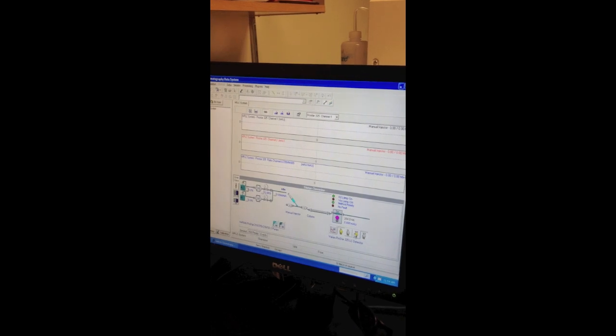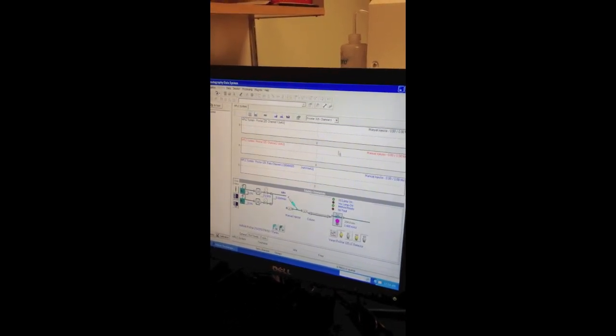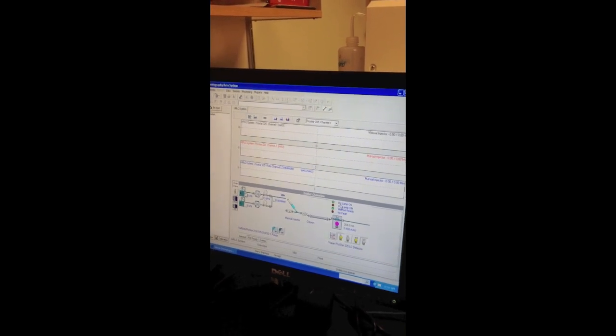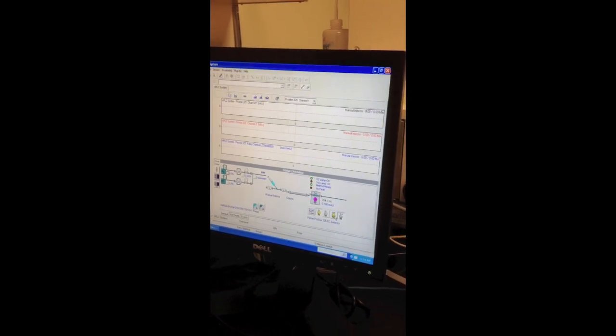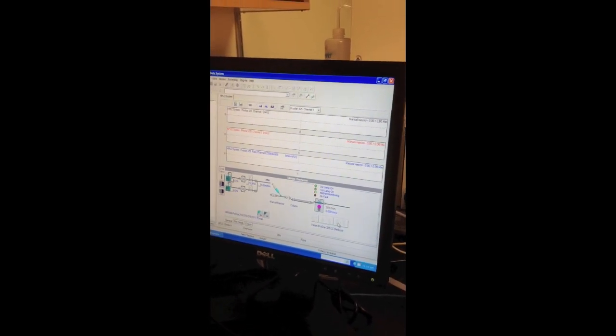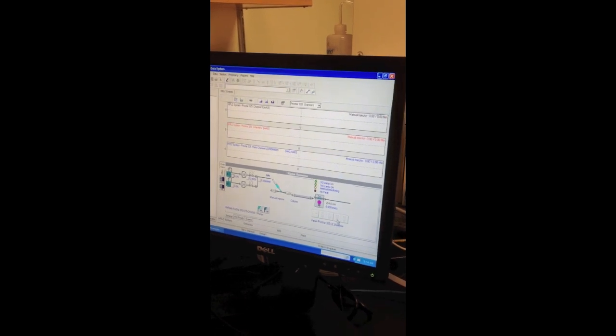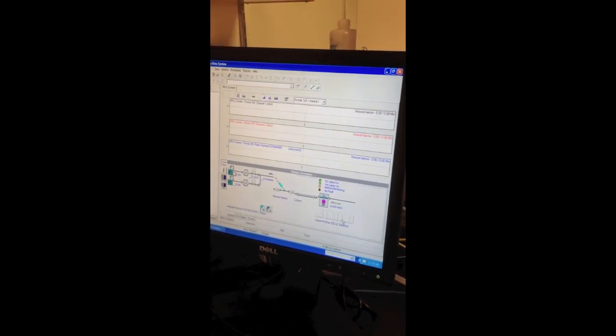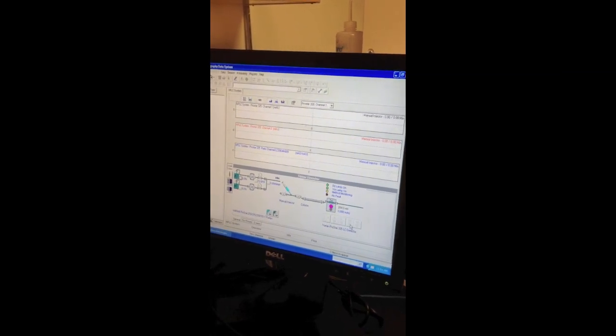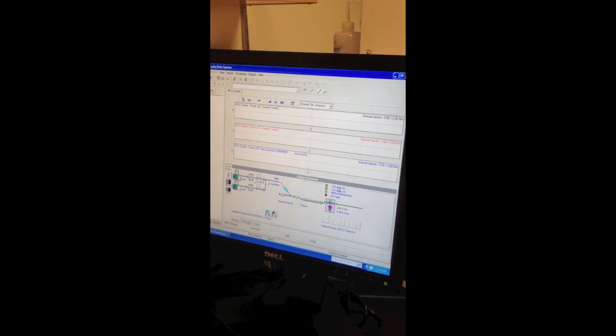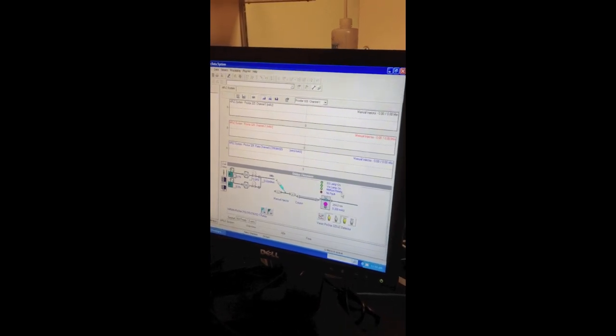Now that these icons pretty much just came to life, you can see here that the D2 lamp is on. And all we have to do now is click on the visible lamp icon. Now this will only take a few seconds. And you can see here that D2 lamp is on, the visible lamp is on, indicated by the green dots, and that now it's ready for the method to be sent over.